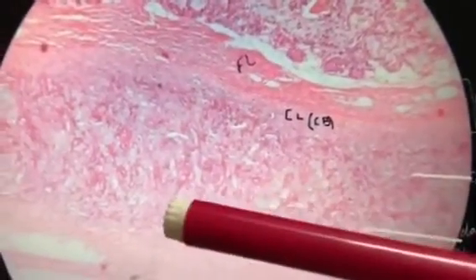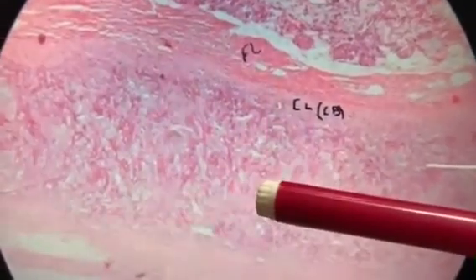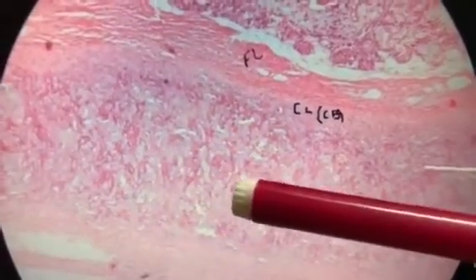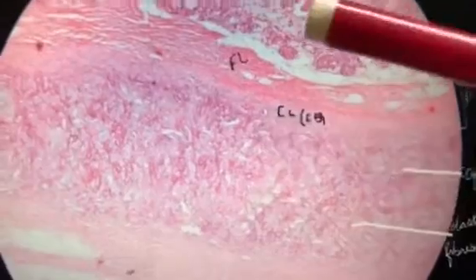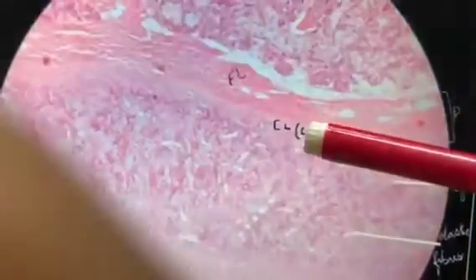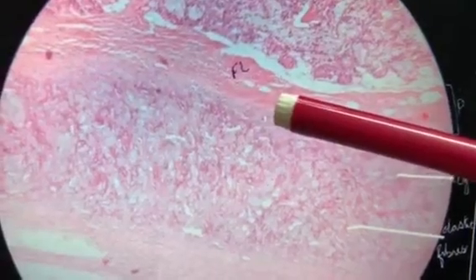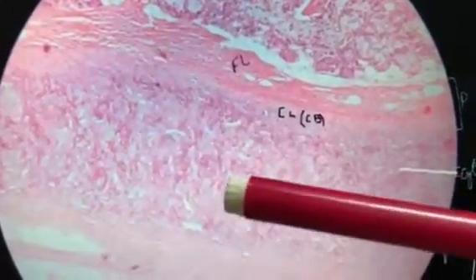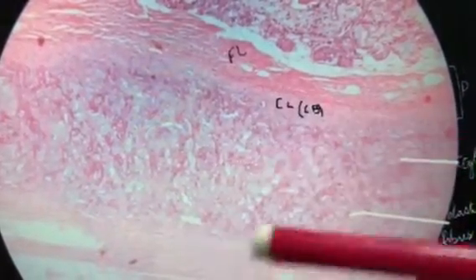Previously we saw the hyaline cartilage blue in color, that means a basophilic stain. Here it is pink in color because these elastic fibers take up eosin stain. That's why it appears pink. This will be asked. Number 1, perichondrium, 1 mark will be given, and number 2, you have to talk about the chondroblast. The chondroblast produces a matrix. So why is it pink in color? Rich in elastic fibers. The elastic fibers take up the eosin stain, that's why pink in color.